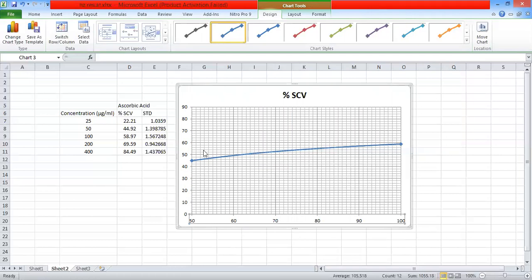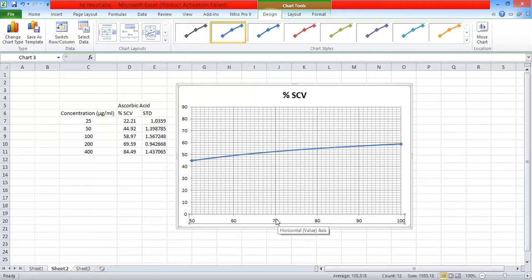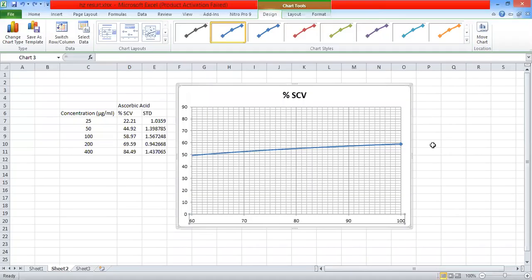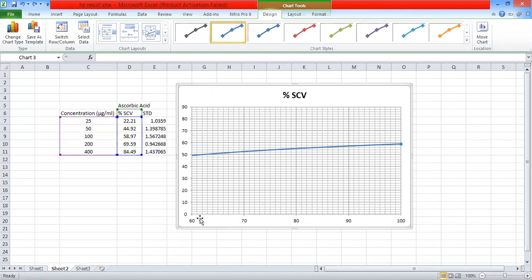Now you can find that the IC50 — that means the 50% inhibitory concentration — lies between 60 and 70. And you can also split this 60 to 70 portion for better understanding and a more accurate value of the 50% inhibition.